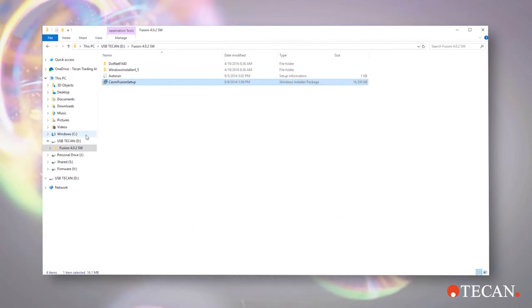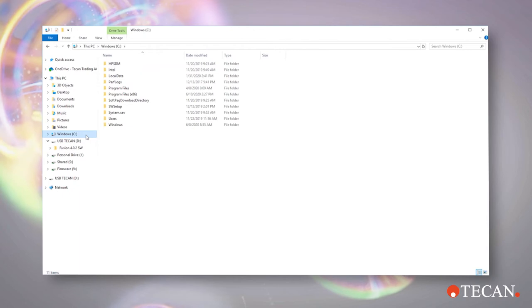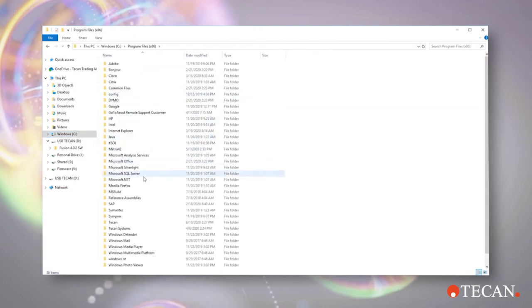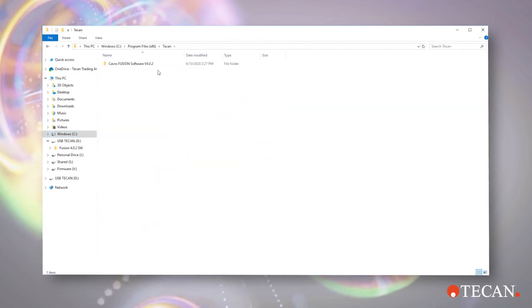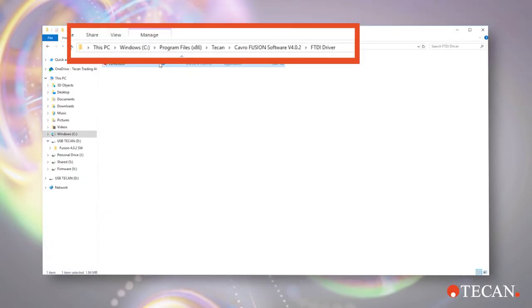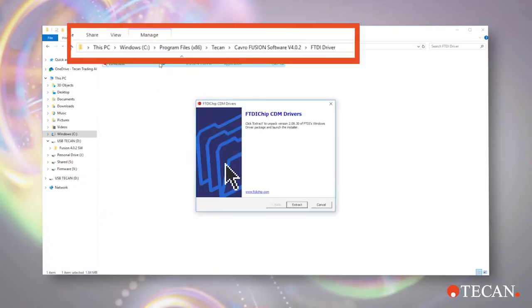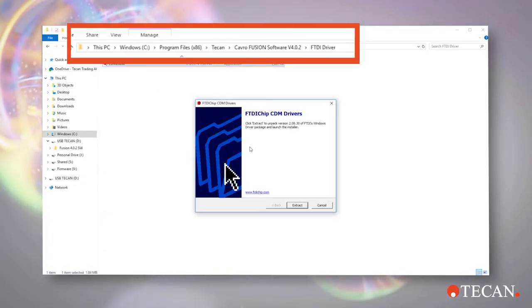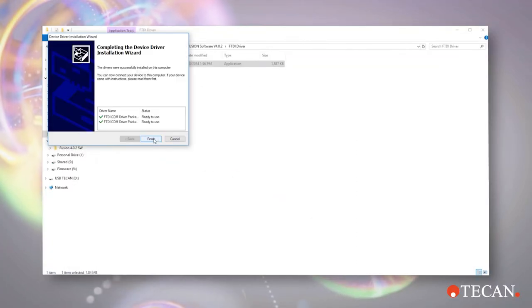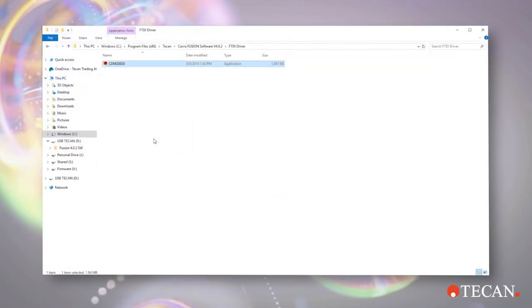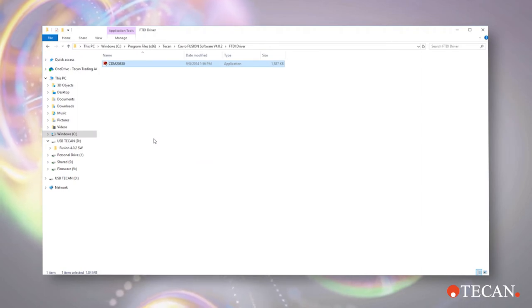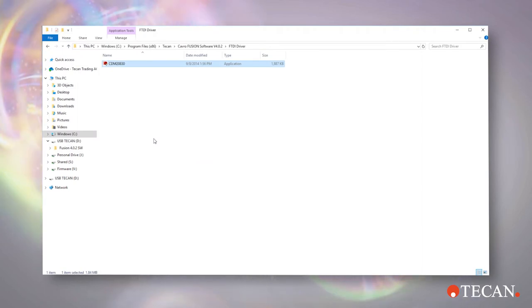Next, and this is an important step, go to the folder on your computer where you installed the software and double click on the executable file in the FTDI folder to manually install the USB driver. This is needed for the laptop to correctly recognize and communicate with the CAVRO hub. This step only needs to be done the first time you use a new laptop with the CAVRO hub.